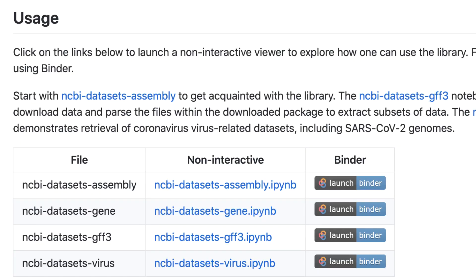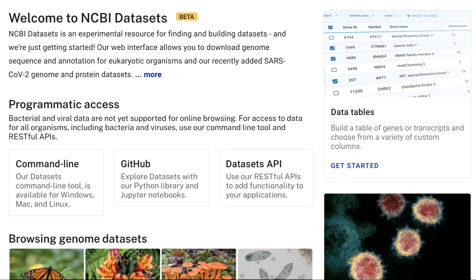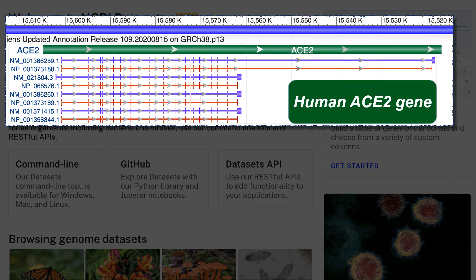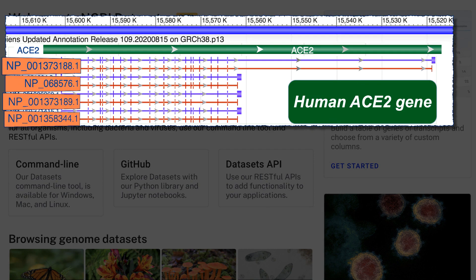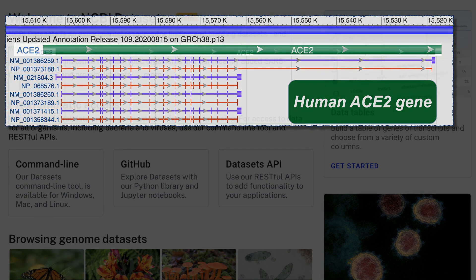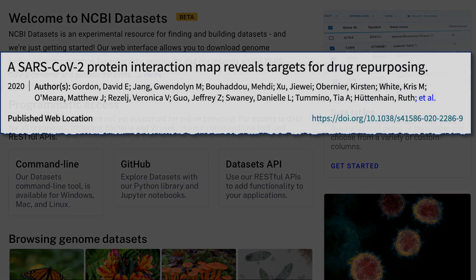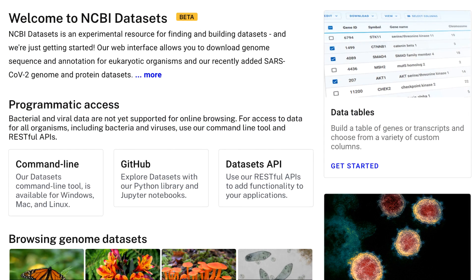We've shown you how to get large genome datasets. Let's see how to access gene data and annotation, including sequence data for the gene, its transcripts, and its proteins. Let's say you want to obtain the latest sequence and metadata on SARS-CoV-2 host genes. A recent paper in Nature identified 332 host proteins that interact with SARS-CoV-2 proteins. We'll get the latest sequence and metadata for a subset of those genes.